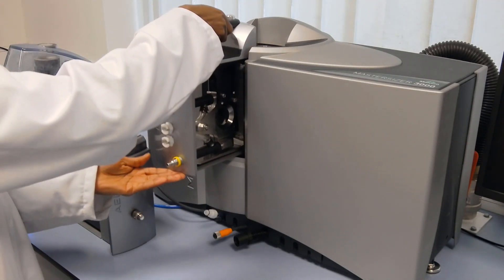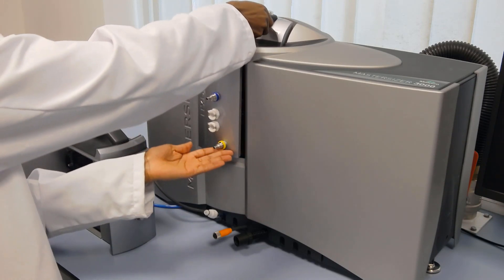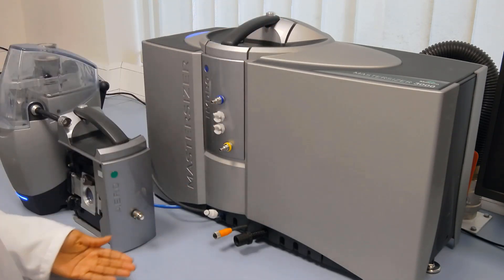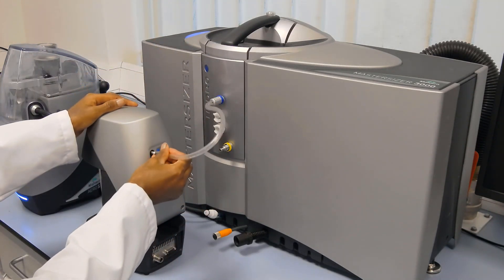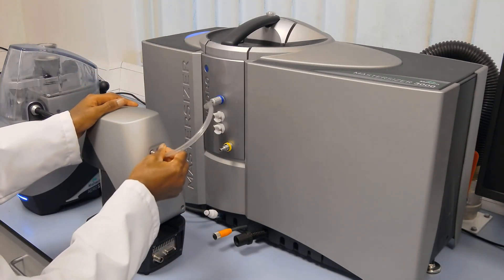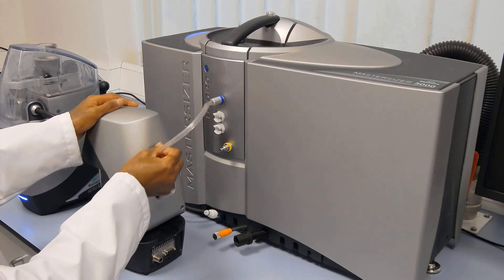To do so, we can swap over the measurement cells, and then connect our wet dispersion units of choice, which in the case shown here is the Hydro EV. The Hydro MV or Hydro LV can also be used for the measurement of metal powders, with the main choice being down to the quantity of sample available to measure.